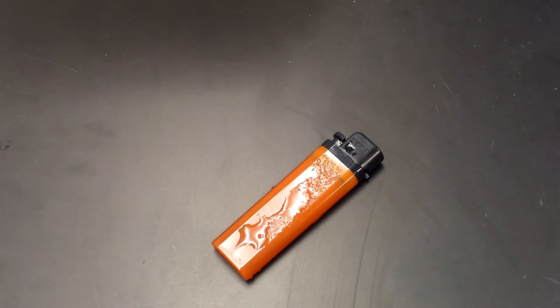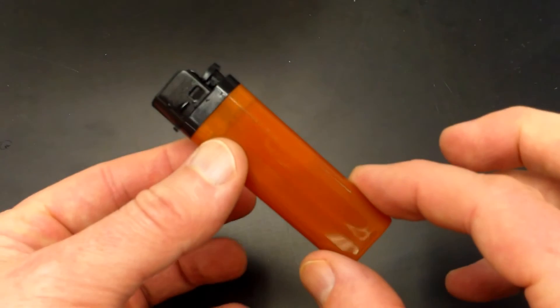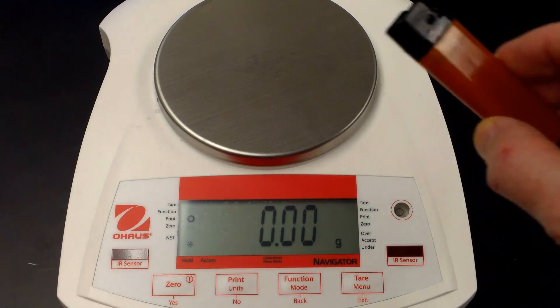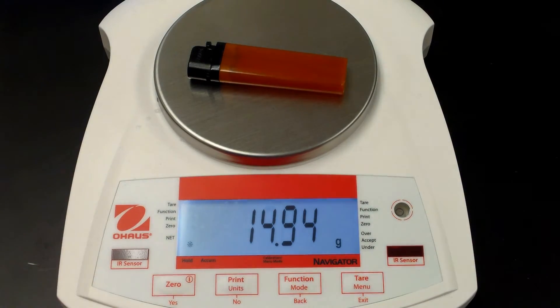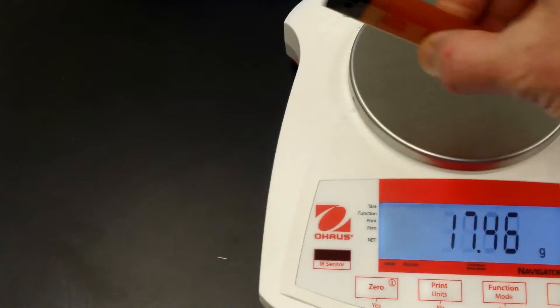Now we need an accurate measurement of the final mass of the lighter — it should be lower after having dispensed gas. I'm going to thoroughly dry the lighter with paper towel. We'll do a few cycles of drying and repeat measurements. Even when I think the lighter is fully dried, it's not really dry — you can see here it's reading 14.94 grams.